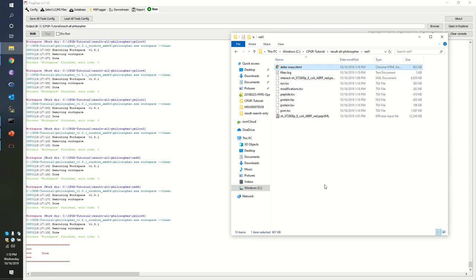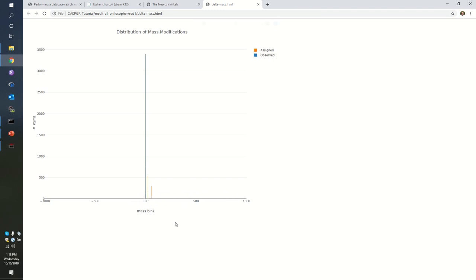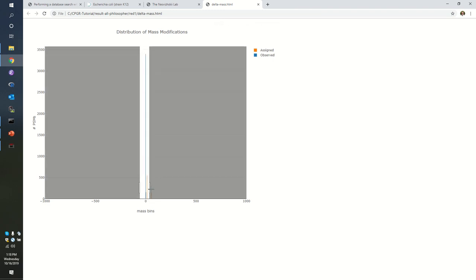I always like the fact that they create HTML reports for us. For red one, we are going to look at the delta mass HTML document. What are we looking at? This is the difference between the mass observed from the peptide ion and the mass observed on the peptide sequence. Oh, look at that. It's interactive. That's so cool.